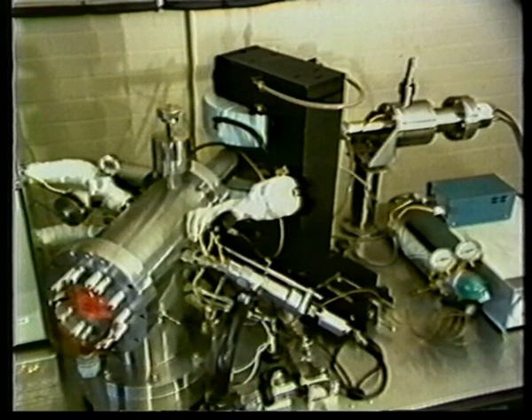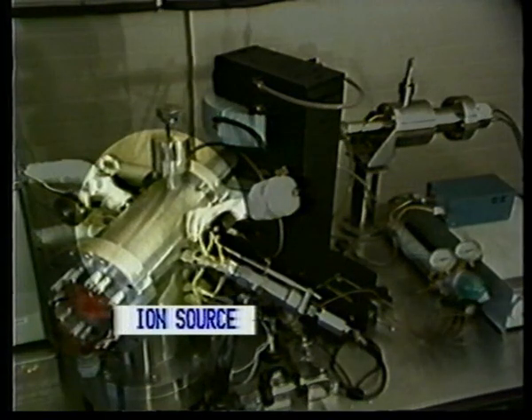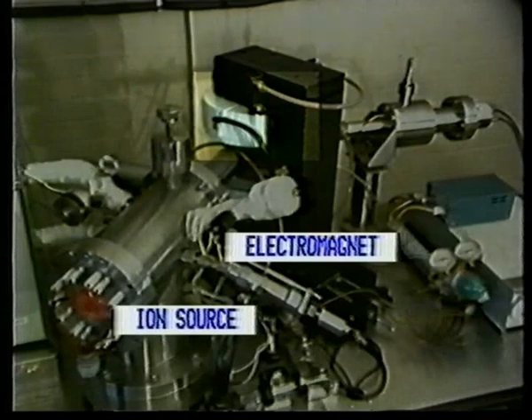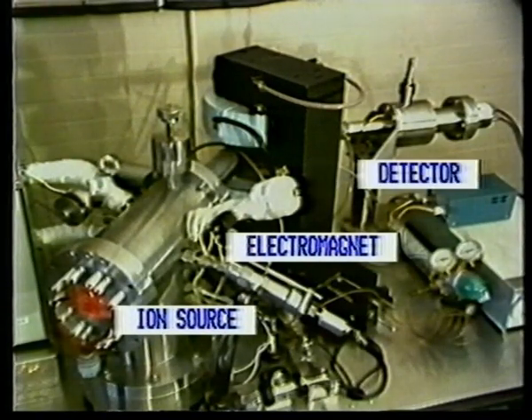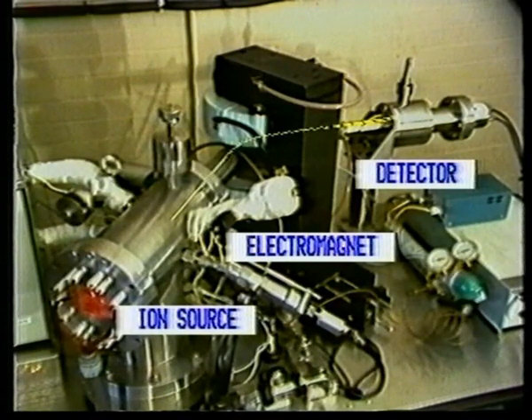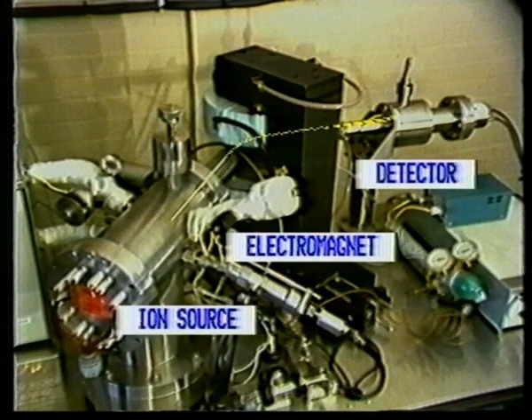Here you can see where all the main parts of the mass spectrometer are housed. The ion source on the left, the electromagnet in the middle, and the detector on the right. The yellow line shows the way in which a beam of ions leaves the source, curves in the vertical magnetic field, and passes on to the detector.